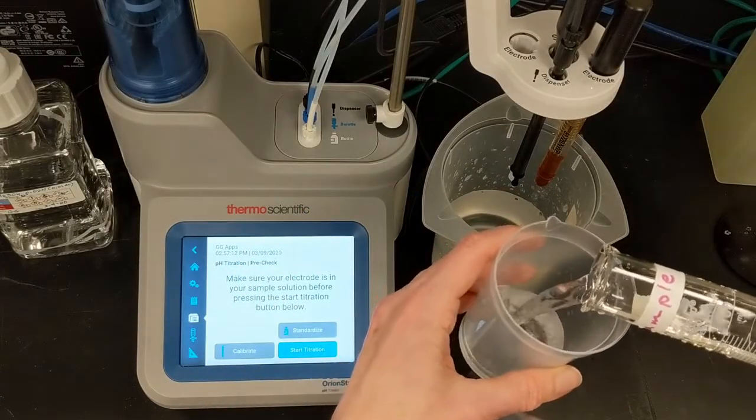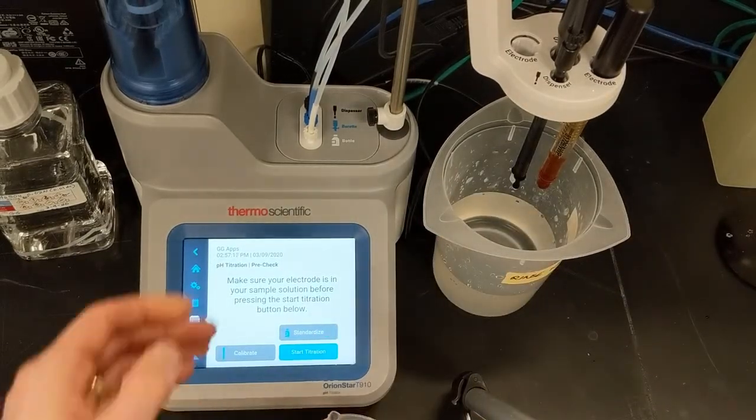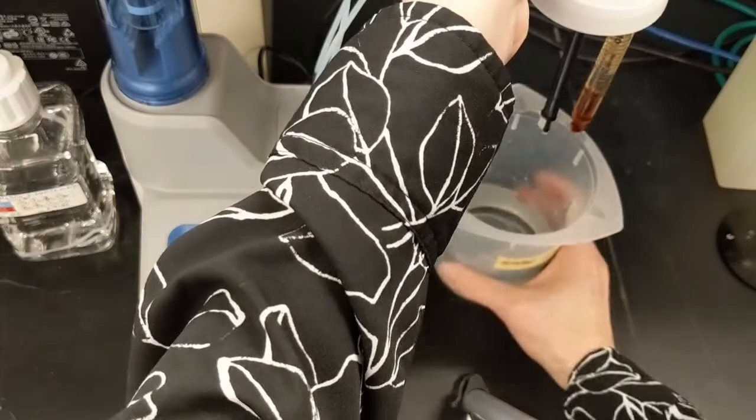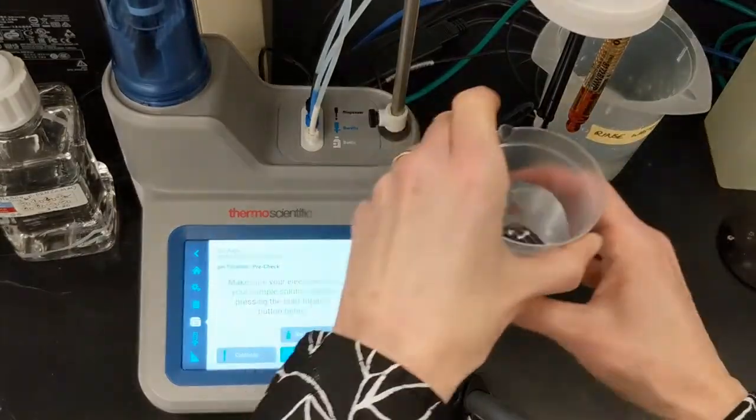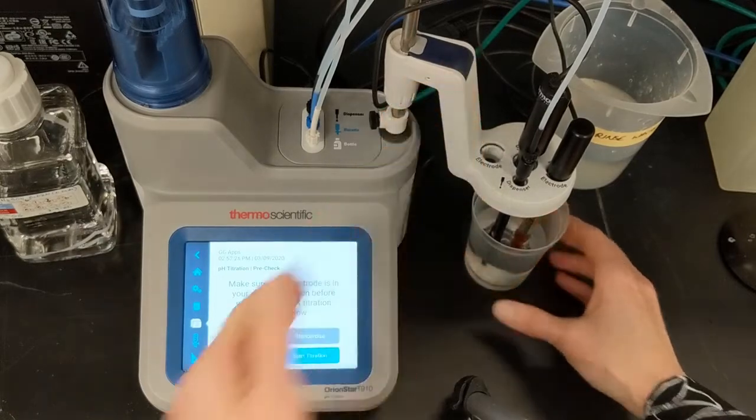I measure 100 ml of the sample in a graduated cylinder and transfer to a clean beaker. I'll lower the holder into the solution and select Start Titration from the Titration PreCheck screen.